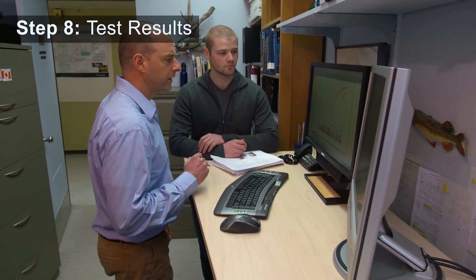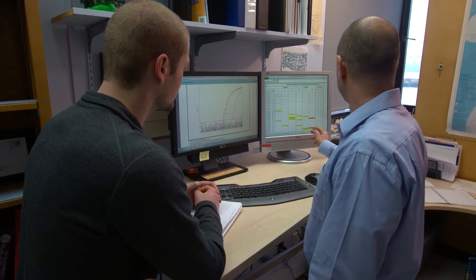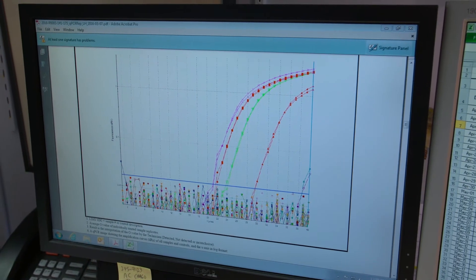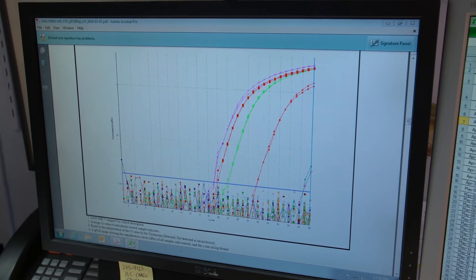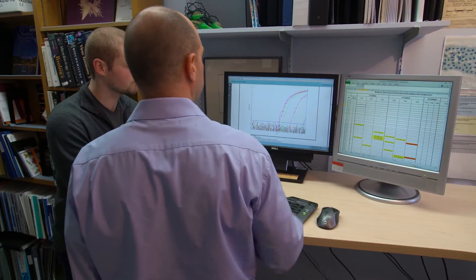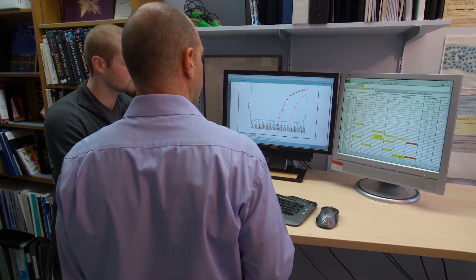Science staff analyze the results from the RT qPCR tests. They are examining amplification curves that will tell them if a particular virus is present in the tissue from the fish sample. This information is critical for identifying the cause of death and helps with decision-making for mitigation.